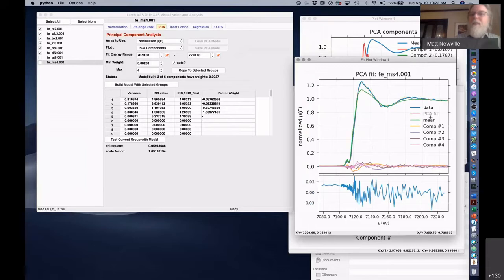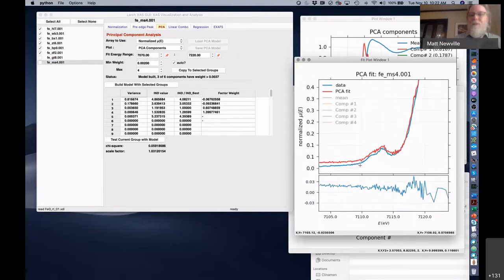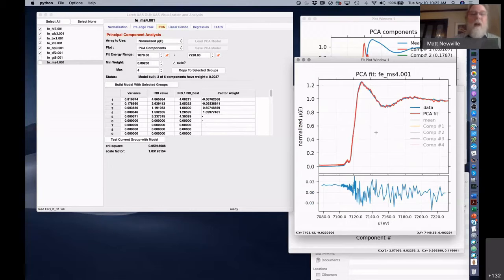Actually, this data set is kind of noisy, and the total fit here is there. So that's actually a pretty good fit. I should probably have worked on the background subtraction a little better. But although this is getting to the noisy level, chi-square is far below 1 here, and the residual plot has no real obvious structure to it.